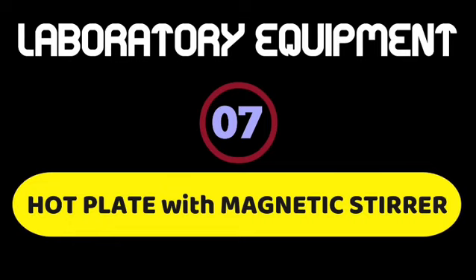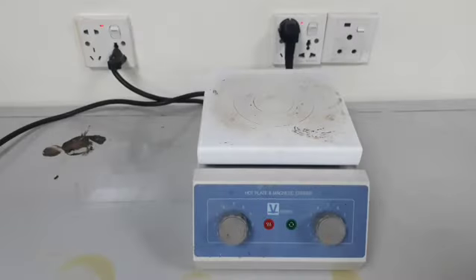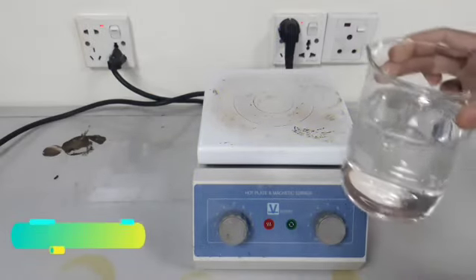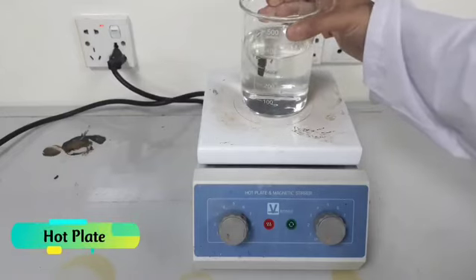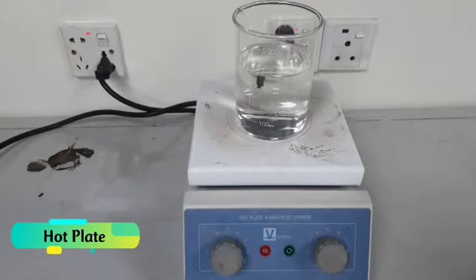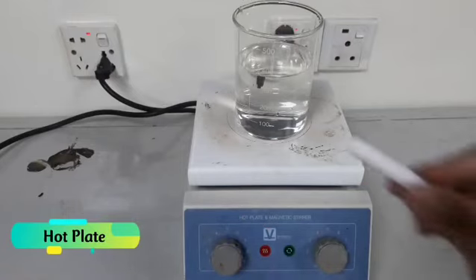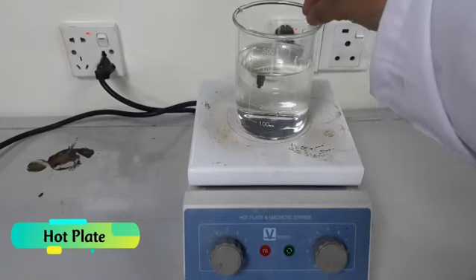Hot plate with magnetic stirrer. It is a small magnetic stir bar placed inside the liquid container. The hot plate generates a rotating magnetic field using an inbuilt motor or electromagnet, causing the stir bar to spin and mix the solution uniformly while heating. It is used to heat solutions and simultaneously stir them with the help of a magnetic stir bar.